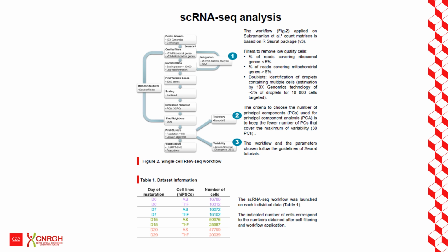We first integrated datasets at the different maturation days to compare the proportion of cell populations. We also looked at the cell trajectory on the integrated datasets to visualize cell differentiation across the different times of maturation. We finally explored the variability of cell populations present in the sample and their distribution in clusters.